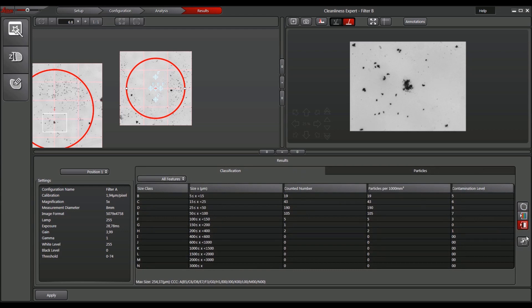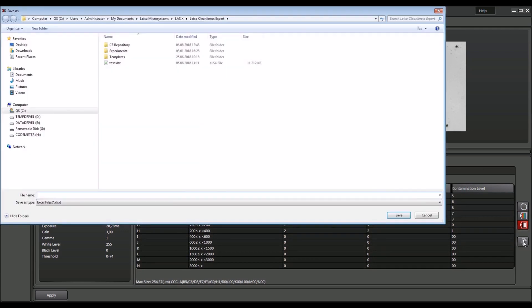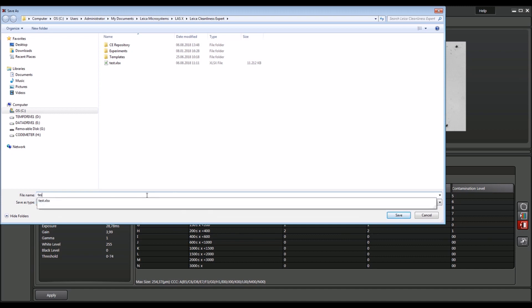To generate a comprehensive report, just click on the Create Report icon and enter a name.